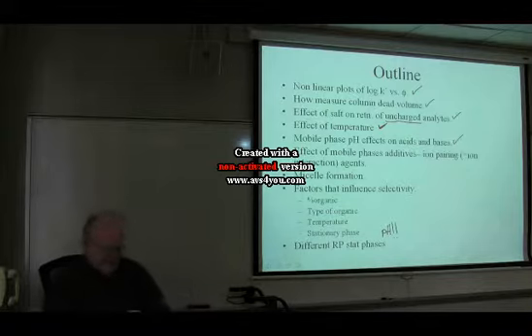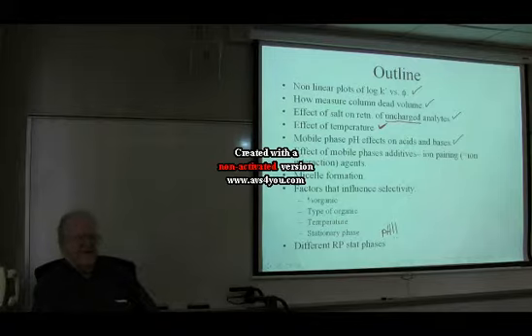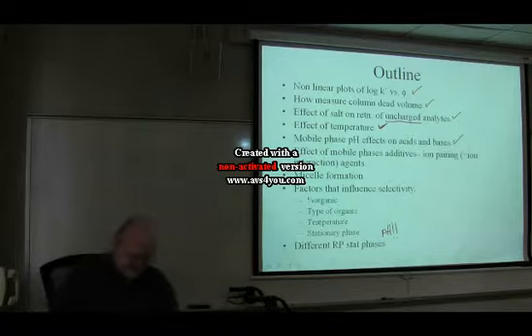You'll see that the mobile phase pH has a humongous effect on the retention and selectivity of things that can ionize, like acids and bases. It is a very profoundly important variable in reverse phase chromatography and ion exchange chromatography.